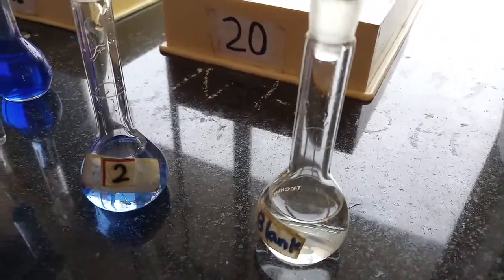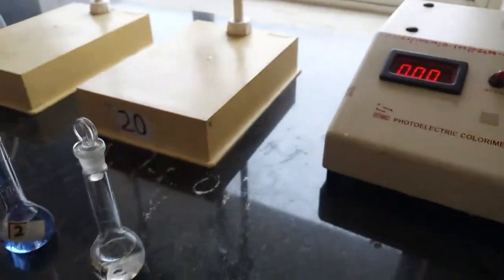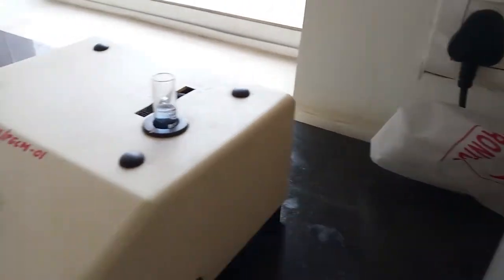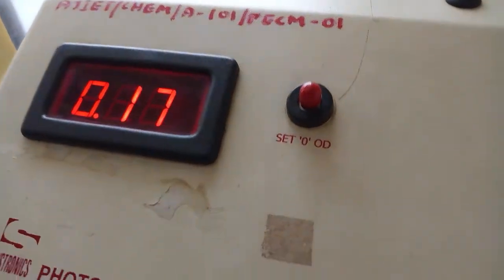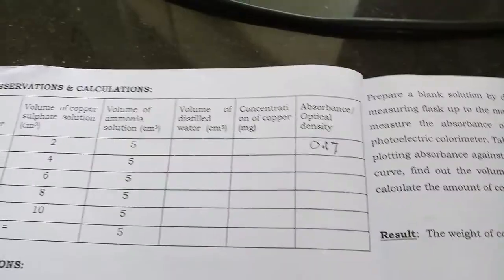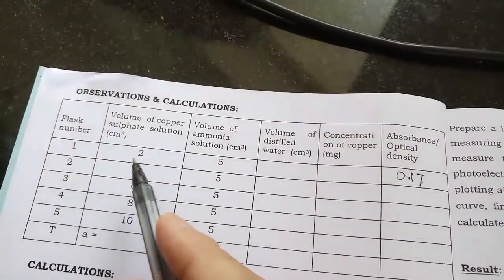Let us take the reading for 2 ml volume of copper sulfate. It is taken in the cuvette, then after drying the outer surface it is carefully placed in the colorimeter. Reading the absorbance: 0.17 is the absorbance for 2 ml, that you have to record in the calculation part.